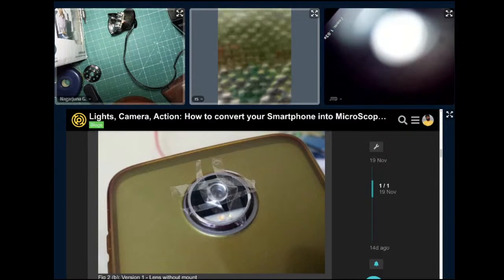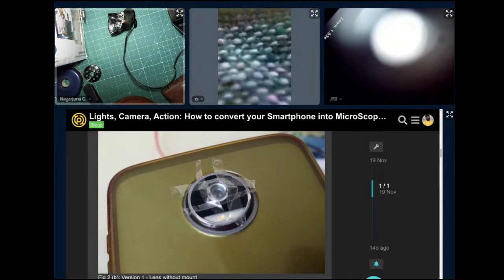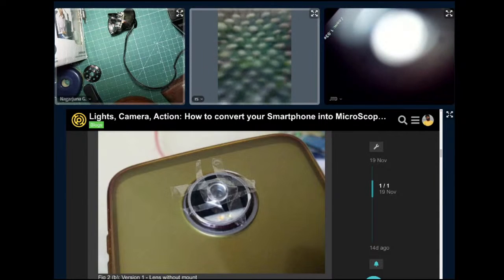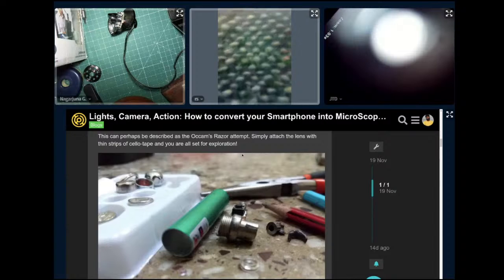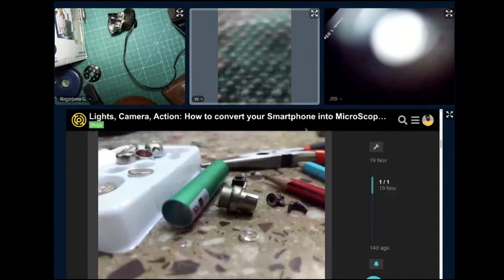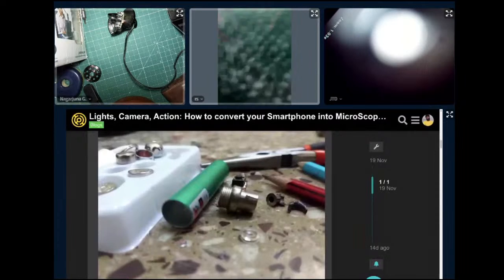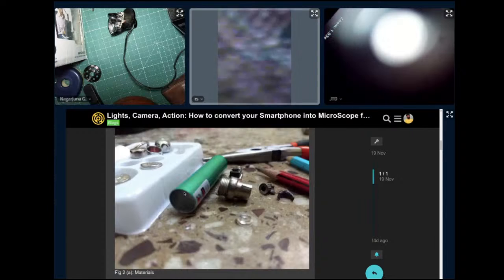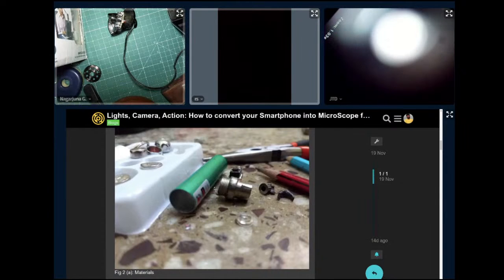Yeah, without a webcam, I think Green Apple was asking. This is something which you can make without a web camera. You just need to procure this laser pointer. DP, can you show the picture of the materials? So this is a laser pointer which you can find very frugally, in many places, like in play toys.